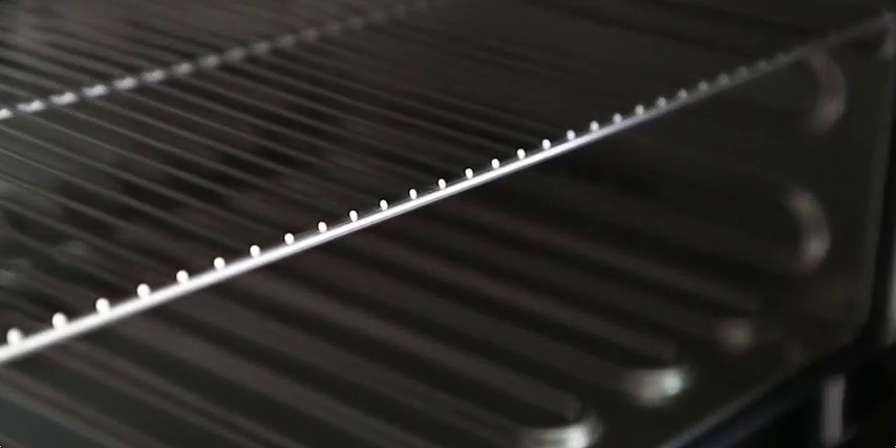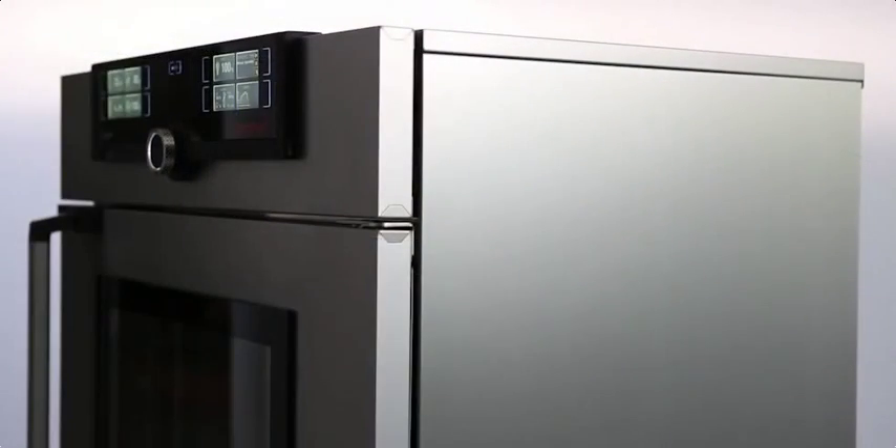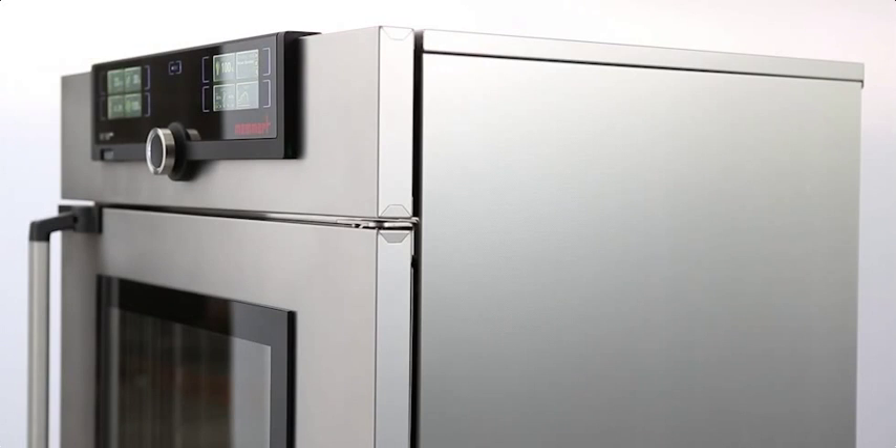For more than 65 years we have pursued one goal when designing our appliances: controlled atmosphere. And this promise to you has a name — 100% atmosphere.